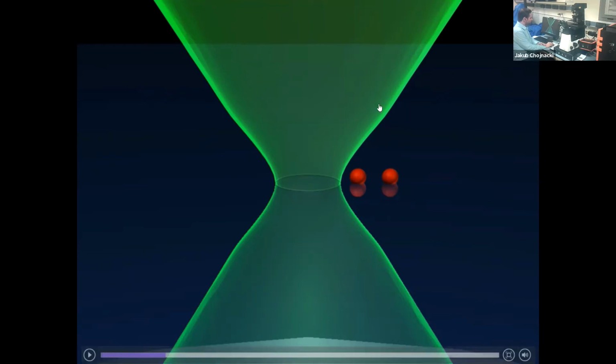As you can see, when we focus the laser light, when you think about it, sort of like common sense, you think that you can focus the light to infinity. But that is not true. The laser light can only be focused to a certain point, upon which, like I was saying, the photons of light start to interfere with one another, and you have an imperfect focus, where you have this sort of diameter, which is the limit of the focusing of the laser light.